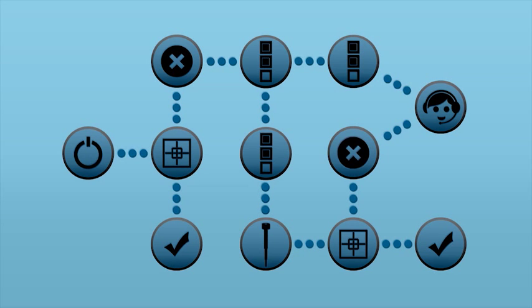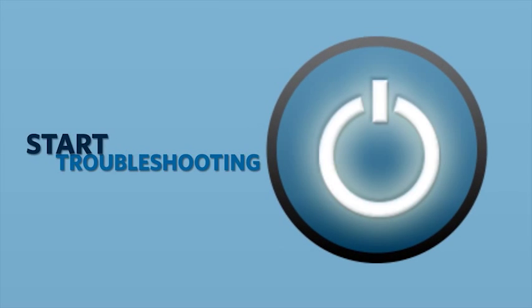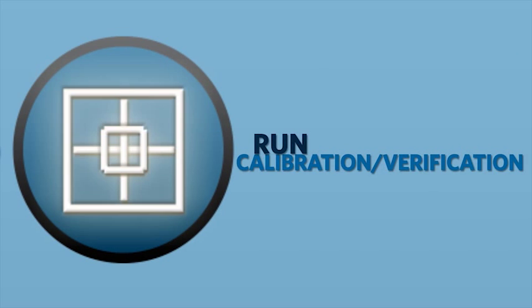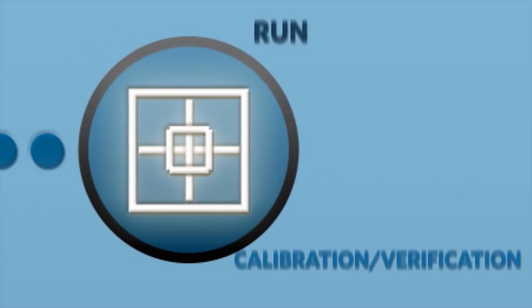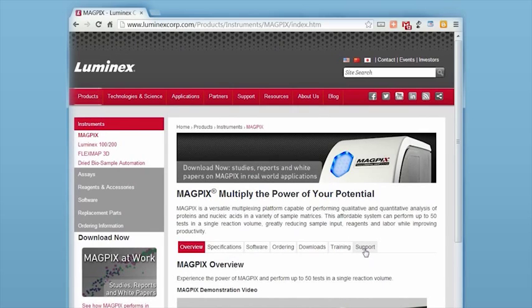We will use this flowchart to guide our troubleshooting. The first step when getting errors on the MagPix instrument is to run a calibration and verification cycle. If you are not sure how to run the calibration and verification routine, refer to the corresponding video on the support tab of the MagPix instrument page at www.luminexcorp.com.